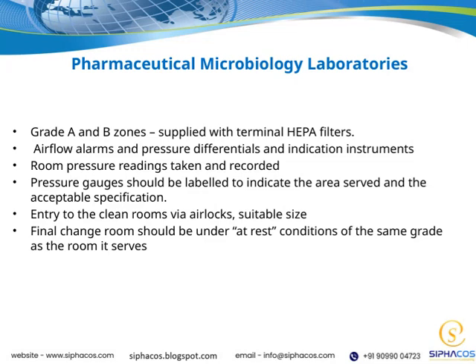Now, let's take a closer look at the key features of pharmaceutical microbiology laboratories. First, the grade A and B zones are critical areas that are supplied with terminal HEPA filters. These filters are essential because they ensure that the air within these zones remains as free from contaminants as possible, maintaining the high standards required for pharmaceutical work.